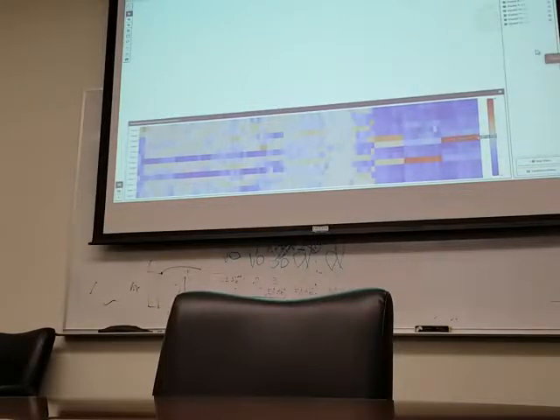And what would be nice, again, this is asking for a lot, but if the genes could be displayed along the side, I guess the x-axis in this case. As you mouse over them, it shows you what genes each column is. So the columns here are the genes, and the rows are the clusters. There are 13 clusters generated based off of the graph based clustering. Is there a way to just put the genes down the x-axis, along the horizontal there? In terms of labels?